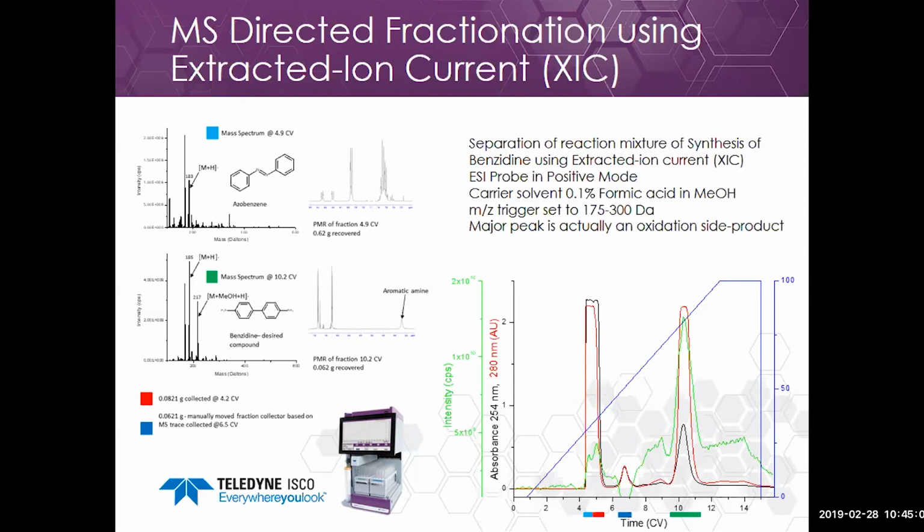So structures are confirmed via NMR there, and so this would take advantage of the range there. You can actually see the intensity of the major product better. So even though the azobenzene is a lot stronger UV chromophore.